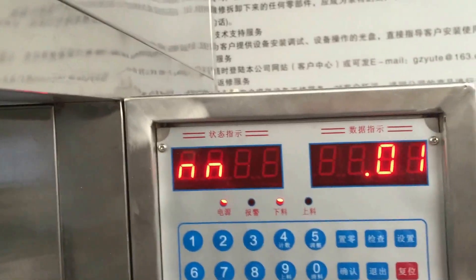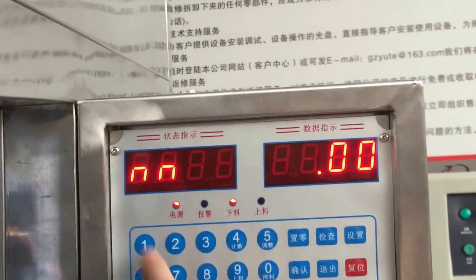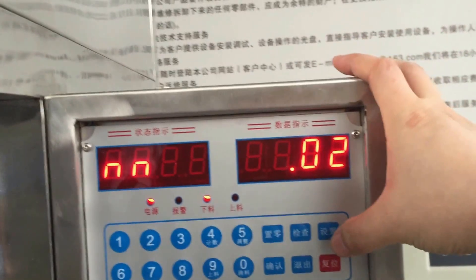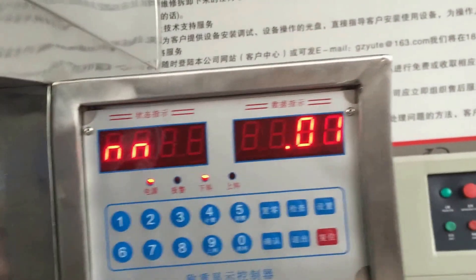Okay, now it's clear for all the control number buttons. Now let's begin to set up the filling volume that you want to fill.